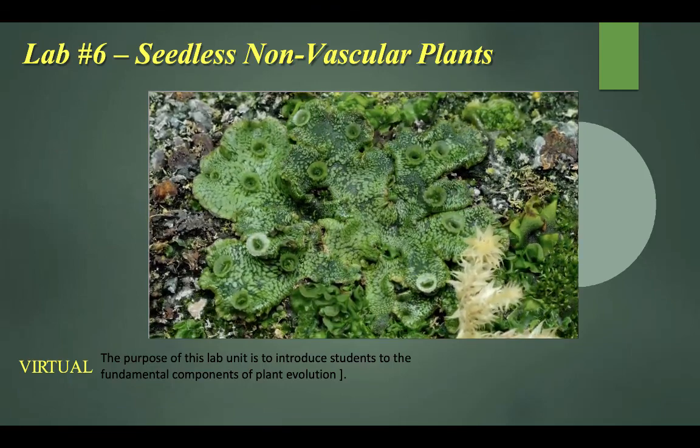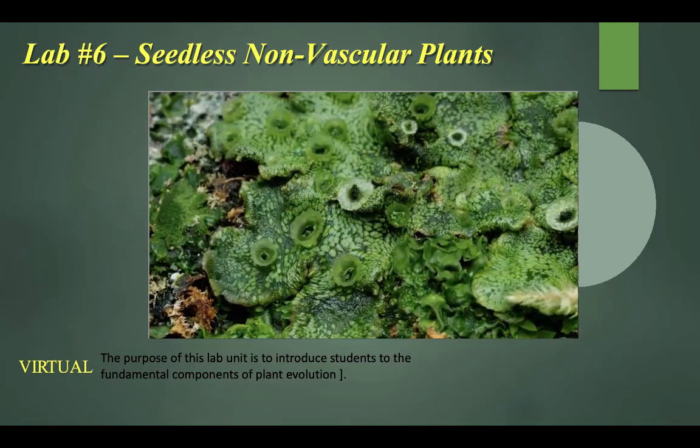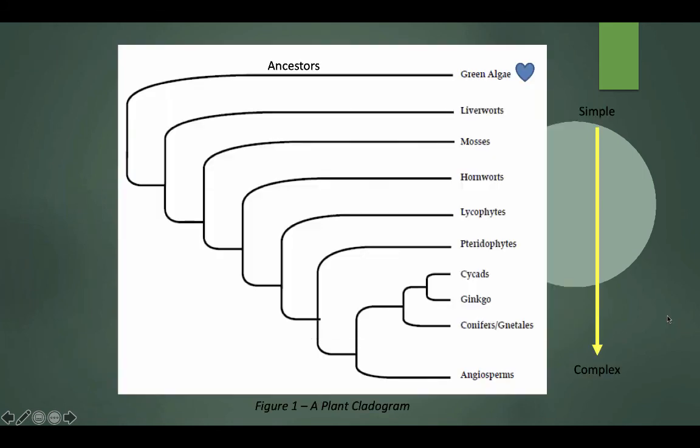You can see this liverwort. What makes it so unique is you can see those little cups on it. Those are called gemmae, and they're really awesome because if you look inside them, you can see these little green things growing in there. And essentially what they do is allow this plant to reproduce asexually, which means that it can just reproduce new growth without having to mate with another plant organism. Just really interesting stuff. Probably makes me a bit of a nerd, but I'm okay with that.